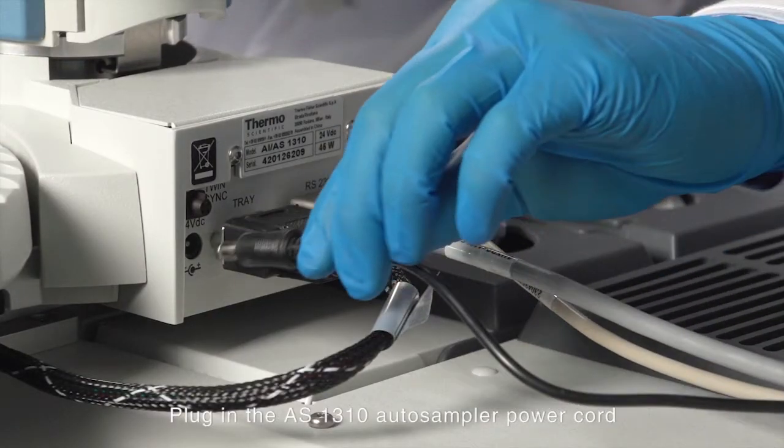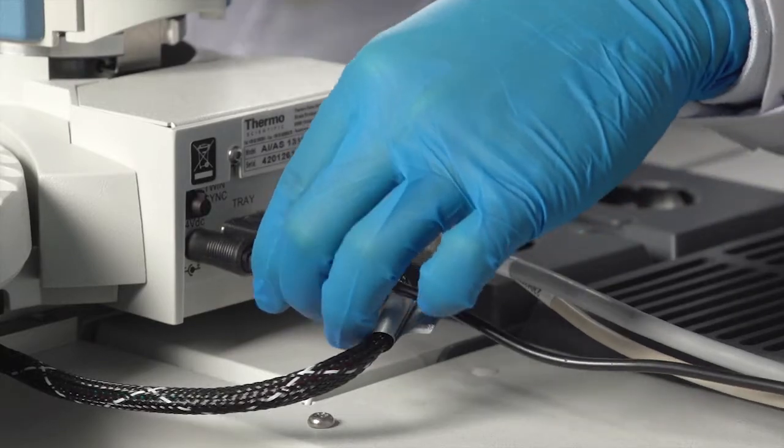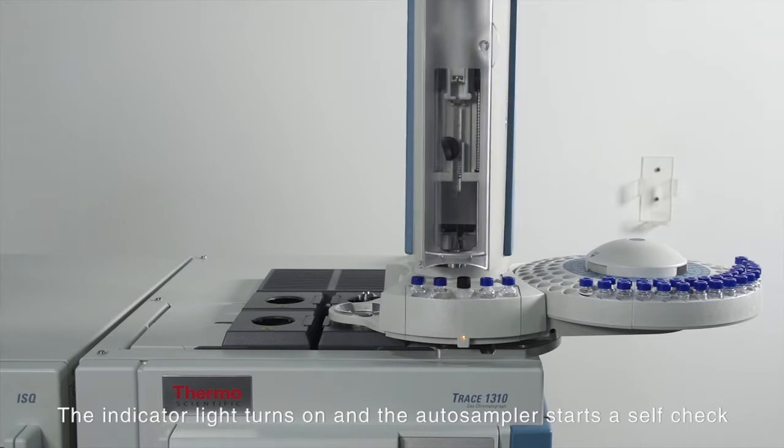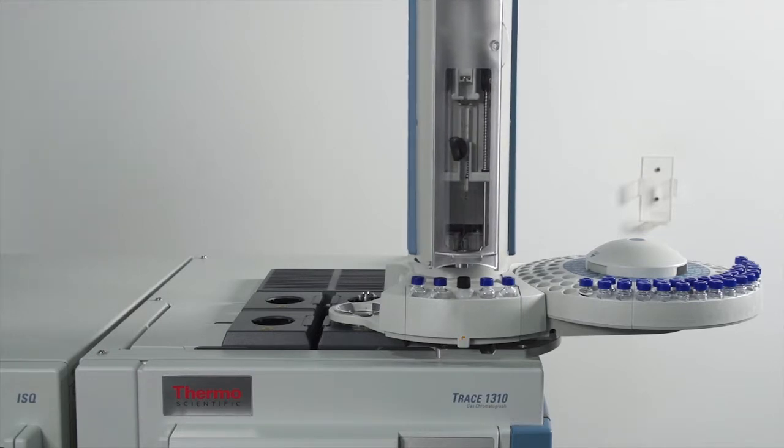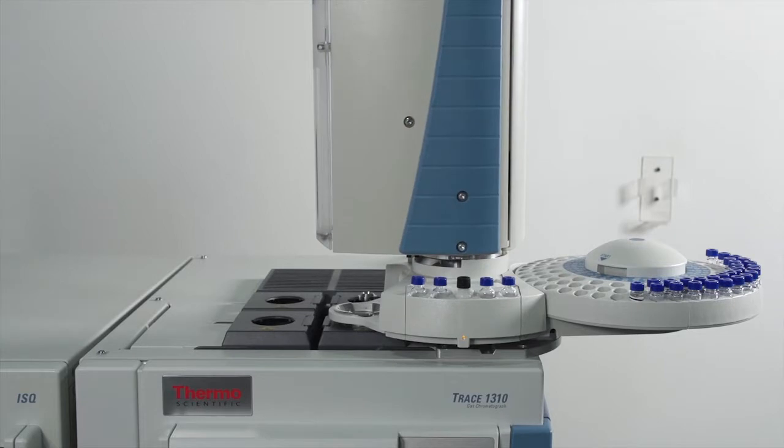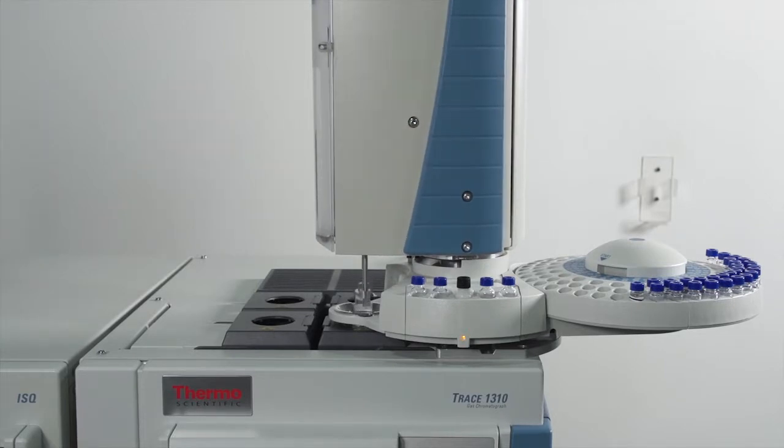...AS 1310 autosampler power cord. The indicator light turns on and the autosampler starts a self-check. When it is done, it will return to the home position.